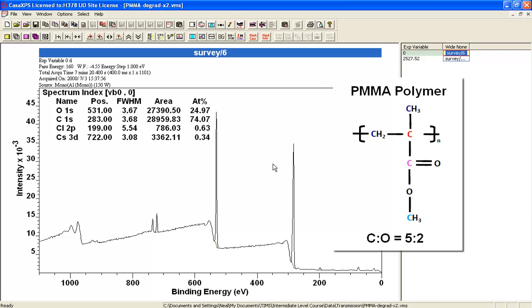That makes us immediately believe that either our quantification is correct and we do not have polymethyl methacrylate in pure form, or our quantification is not as accurate as it ought to be.